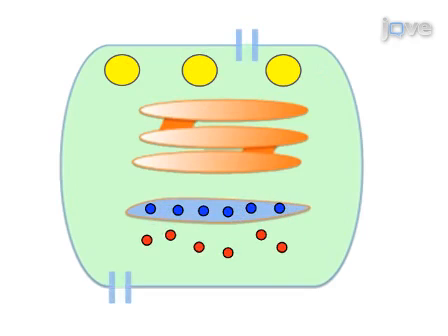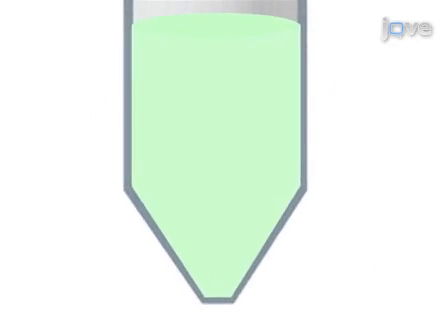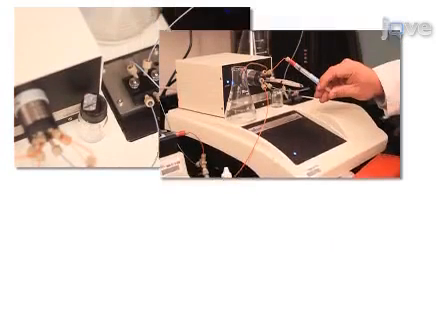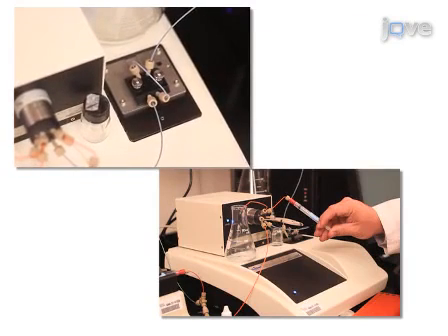Digitonin is then used to selectively permeabilize the plasma membrane. Following cell permeabilization, the cell extracts are partitioned into separate membrane and cytosolic fractions using differential centrifugation. As a final step, surface plasmon resonance, abbreviated SPR, is used to detect and quantify toxin entry into the cytosol through perfusion of the cytosolic fraction over an SPR sensor coated with an antitoxin antibody.